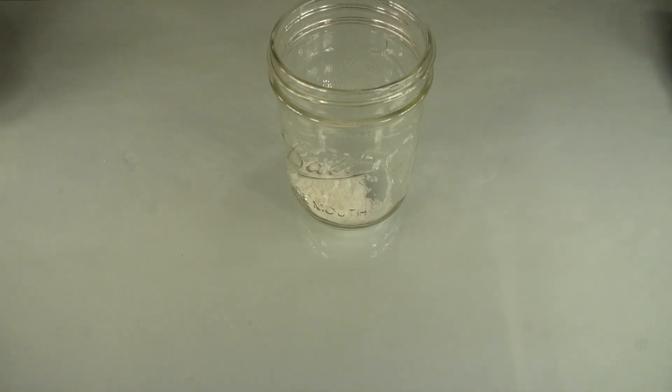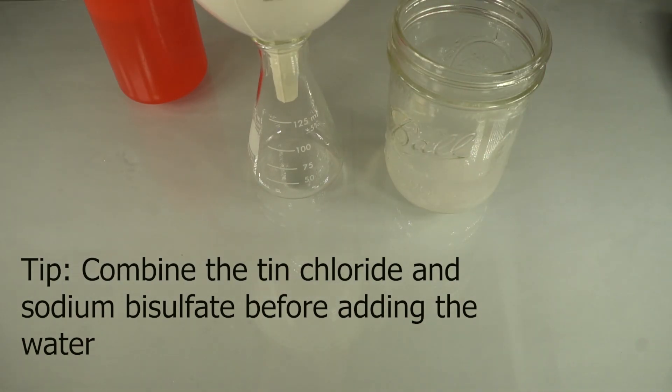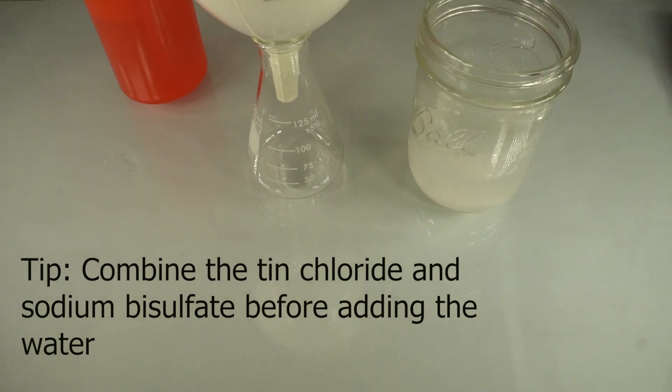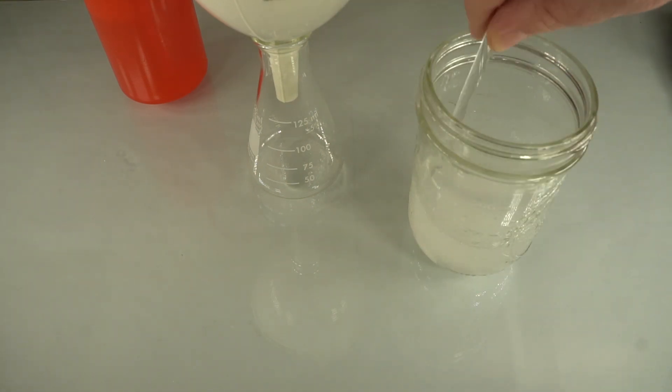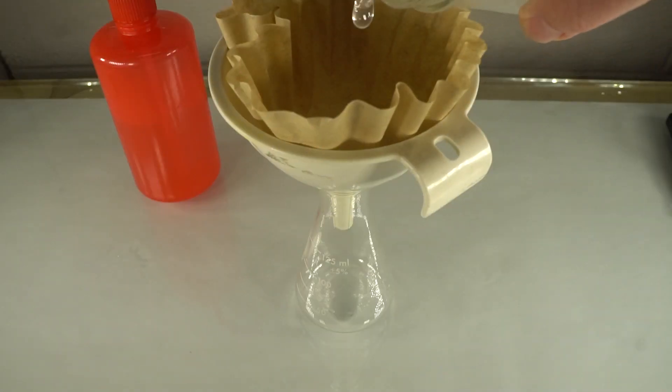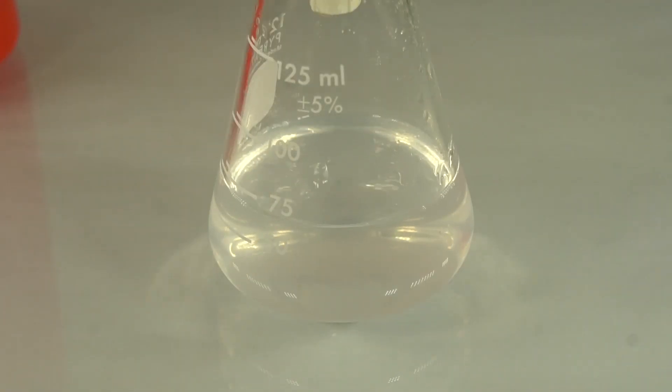Combine 12 grams of tin chloride, 6 grams of sodium bisulfate, and 125 grams of distilled water. Mix the solution until everything dissolves. It will be very cloudy. Filter the solution through a coffee filter to remove some of the particulates. The solution should be much clearer now.